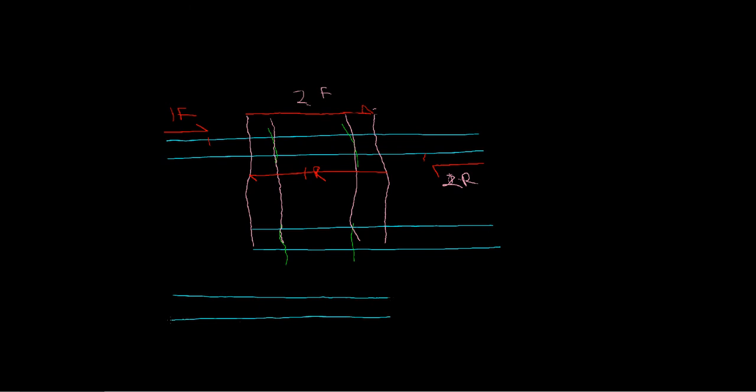And we'll annotate this as well. So we get a little bit about 20 base pairs upstream. So this is about 20 base pairs for all the way up here. And we get about 20 base pairs downstream from that oligo. That's another 20. And then we have this region in here that we want to mutate.